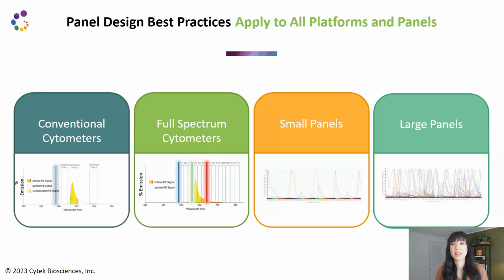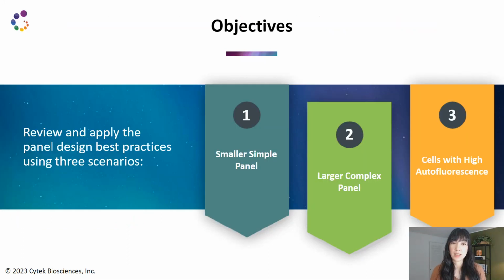Now, of course, depending on the scenario that you're in, you might want to use slightly different strategies. So as I go through the talk today and I talk about these panel design best practices, I'm going to do so using 3 different scenarios as examples. So the first scenario is your smaller, simple panels. And really, this is the basic information that everyone should find useful. The second scenario is for those of you who may be interested in doing something that's a little bit larger, a little bit more complex. I'm going to give you some strategies to apply to that specific scenario.